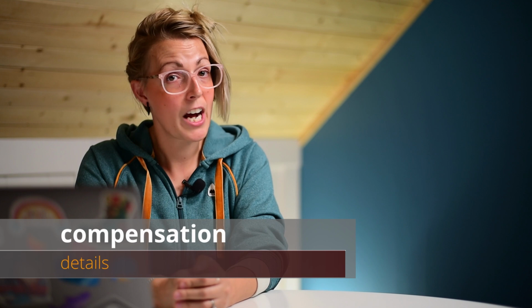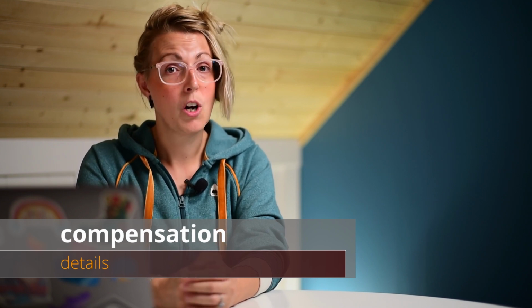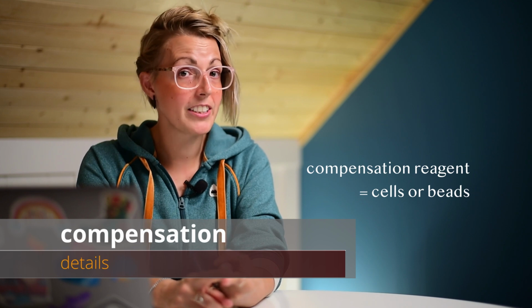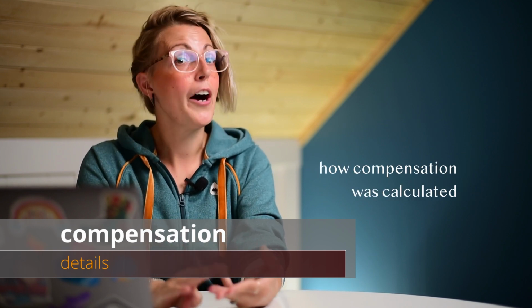Under data acquisition, this is also where you would discuss how you did your compensation. In this section, you would supply details on what you used for your compensation reagent, i.e. cells or beads, how your compensation was done, how your compensation was calculated, and in some cases you may even include your compensation matrix. Including this is important because uncompensated or improperly compensated experiments can result in artifacts in measurement which will change the quantification.